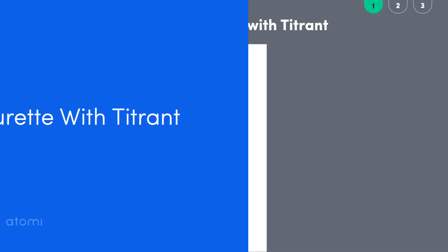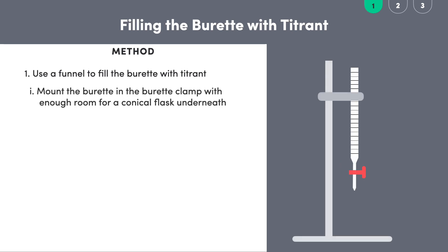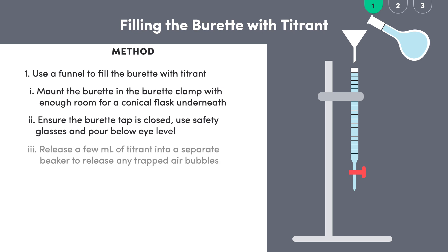Our first job is to fill the burette with titrant which we deliver into the conical flask. We mount the burette in the burette clamp attached to a ring stand with enough room for a conical flask underneath. To avoid chemical spills we check that the tap is closed and use a funnel to help fill the burette with the titrant, sodium hydroxide in this case. Generally we fill to almost the top of the burette and then we open the tap to release a few milliliters of the titrant into a separate beaker. This is to release any trapped air bubbles which may be lying at the bottom of the standard solution.